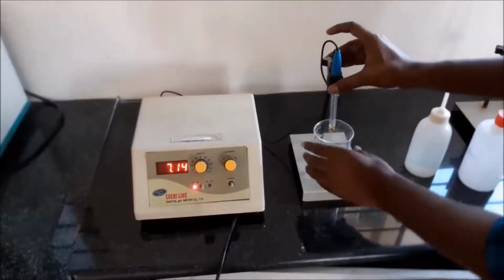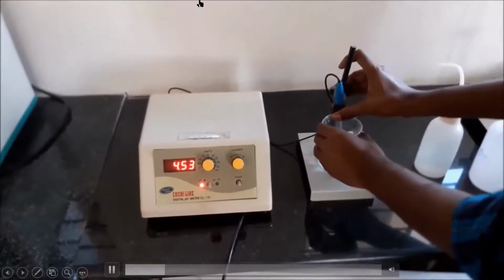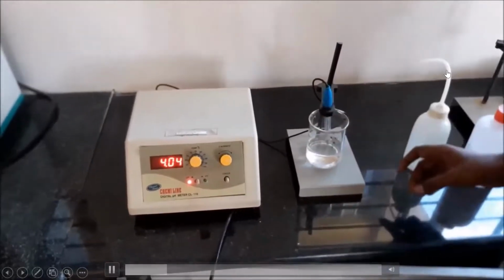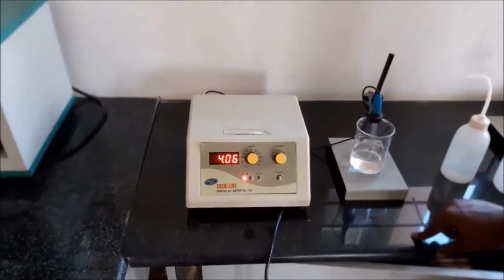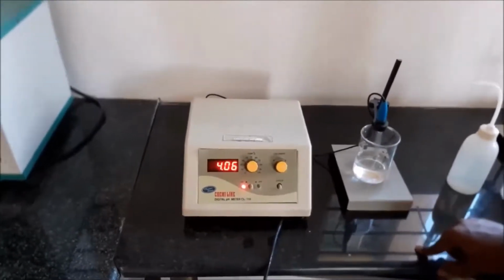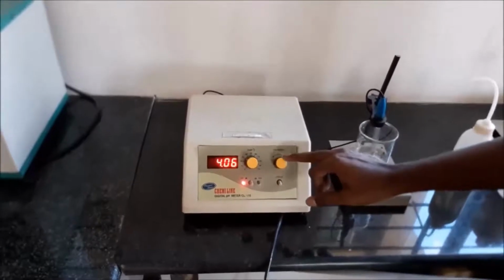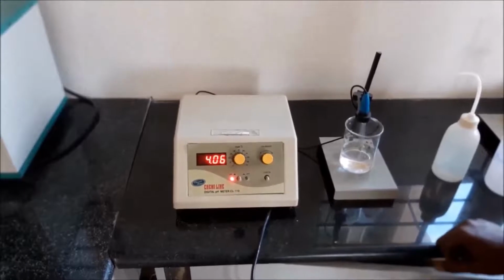And the electrode is dipped inside the beaker so that it is placed inside the buffer solution. And then if you can just see, the value is almost nearer to 4, but we can readjust and recalibrate it again. So it's almost nearer to the 4.